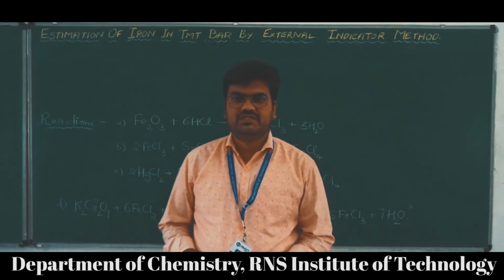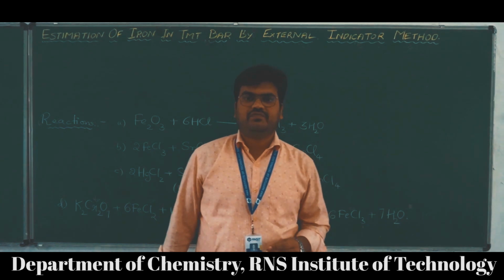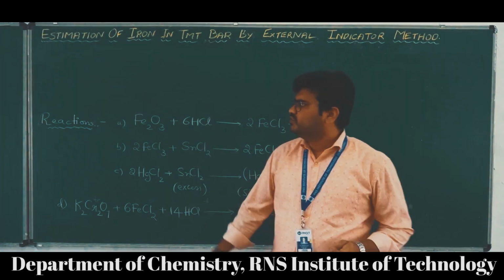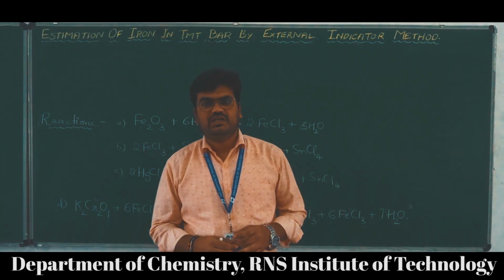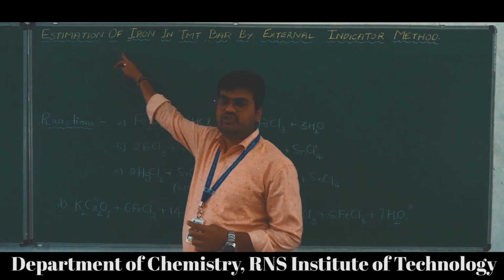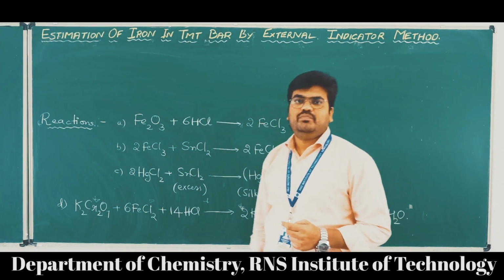Hello everyone, myself Dr Pradeepa S M, working as an assistant professor in Department of Chemistry at RNS Institute of Technology. So now I am here to explain one of the very important experiments which is coming in our chemistry subject, and this is the experiment: estimation of iron in TMT bar by external indicator method.